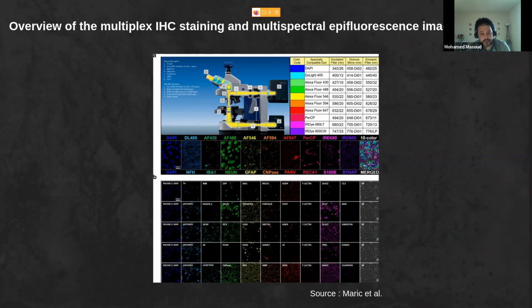So based on that, they have different wavelengths and are used in this microscopy in order to capture different cell types based on the antigens of these cells and the antibodies used in this experiment. So coloring, or actually giving different differentiation for each cell, is a process that can be done automatically during the experiment and can also be done during image processing in a later step.